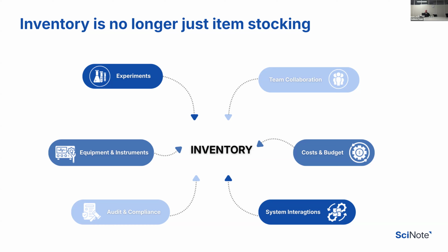What's very relevant, we've seen in the past, is that these inventories need to be very well integratable. What does this mean? They need to be able to talk with other software. They need to be able to say, okay, if somebody updated something in a different software, the central inventory has to be updated as well.